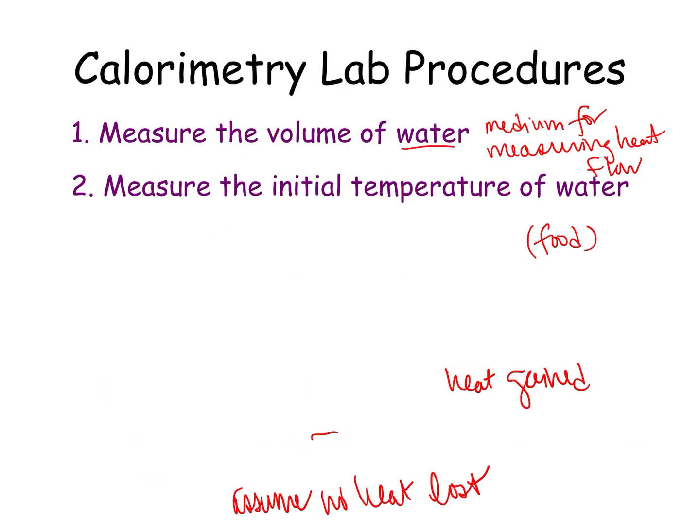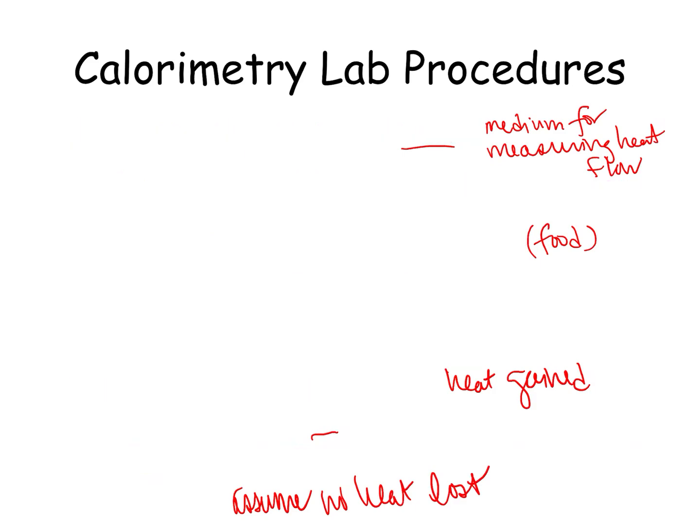So I am a terrible artist, but go with me here. You are going to have a little piece of metal, and the metal is bent, and tape it to either the lab bench or a ceramic tile, and that metal conducts heat and electricity. So on the metal you put a piece of food. So here's my piece of popcorn. Okay, so then we're going to burn it, light it on fire. So now this is going to be like a cut through.